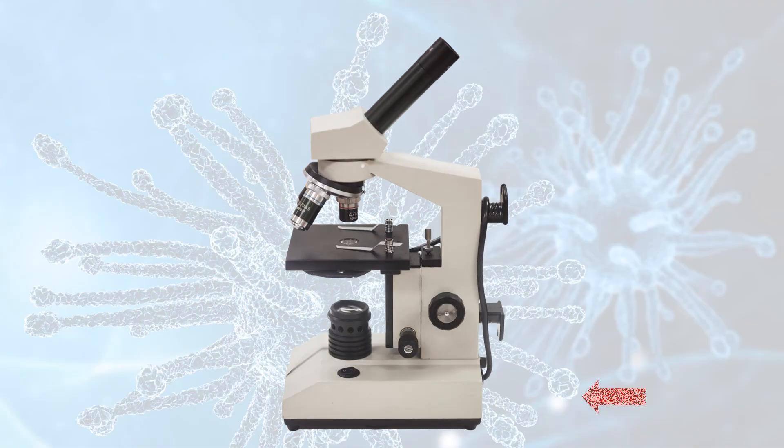Last but not least, we have the base. And its purpose is pretty straightforward. It supports the rest of the microscope, which sits on top of it.